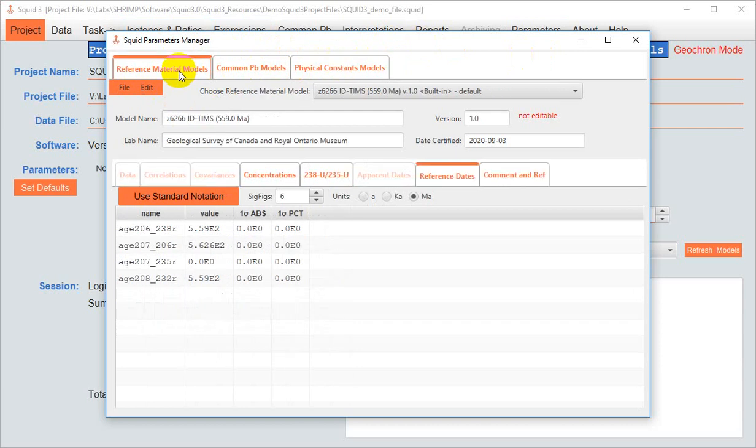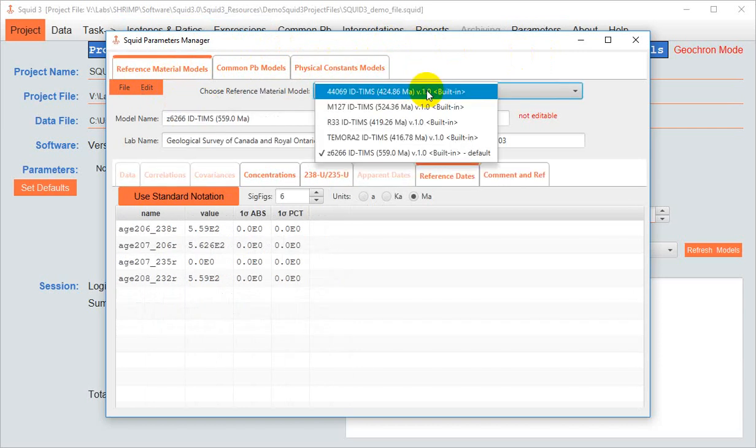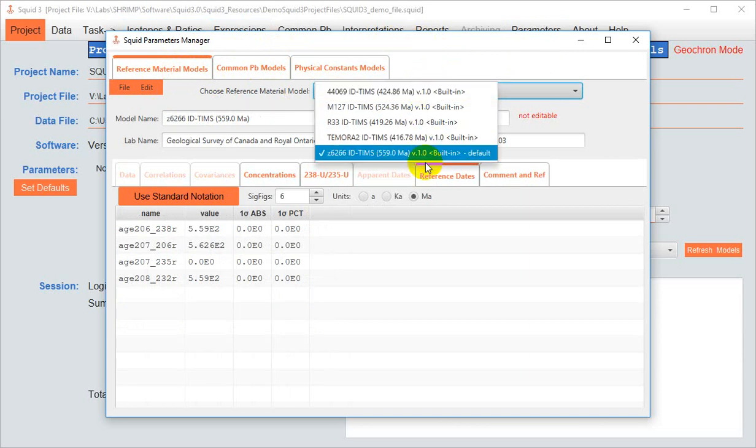We'll start by looking at the Reference Materials Model tab. From here, you can select a particular reference material model from the drop-down list. Here we have the five reference material models that came built in with SQUID3.